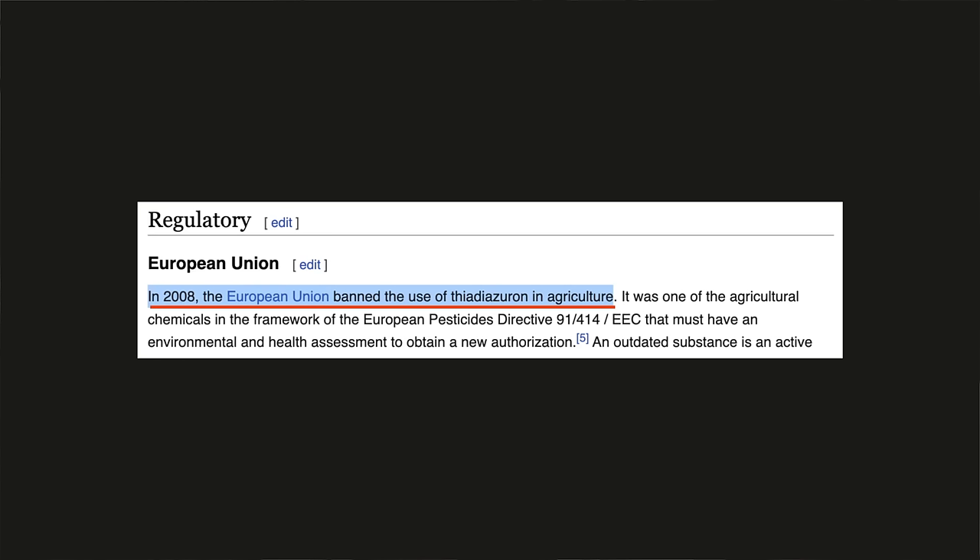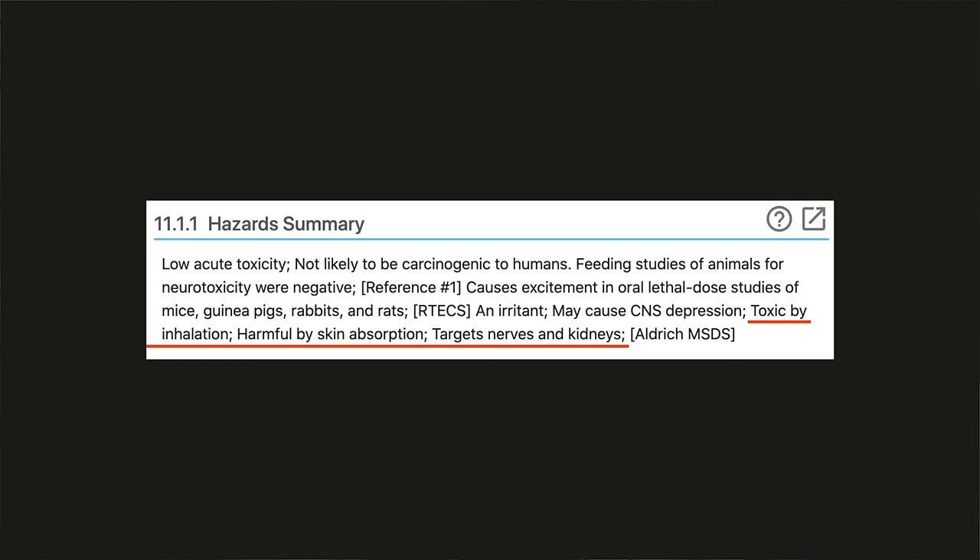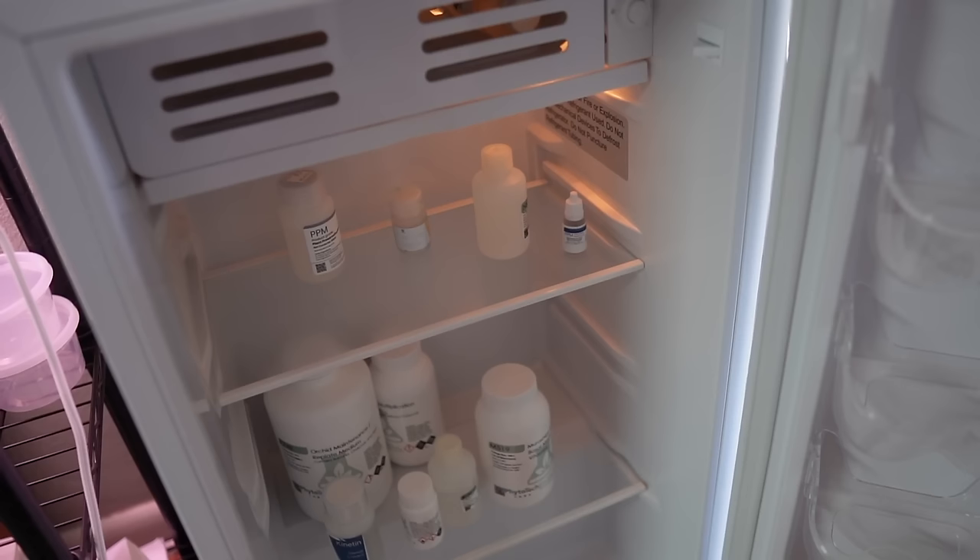Some plant growth regulators can be dangerous to use. There are certain PGRs I will not even keep in my house, including TDZ, which is known to be able to cross the blood barrier just by touching it. These chemicals cause rapid cell mutation and multiplication in plants, so we don't want to be touching them — they can be harmful to us, our pets, and the environment. Always wear gloves while handling PGRs and store them separately from your food.